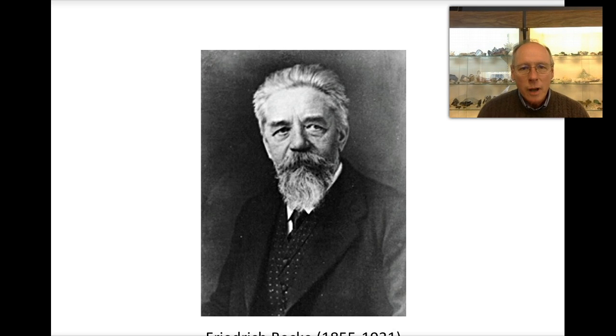In the late 1800s, an Austrian mineralogist named Friedrich Becke devised a method for comparing the relative indices of refraction of two materials. In our case, the two materials could be a mineral mounted in epoxy, or a mineral immersed in a refractive index oil with a particular value, or two adjacent minerals. The contrast in indices of refraction causes the light to be bent, but the direction of bending or refraction varies depending on the relative indices of refraction of the two materials.